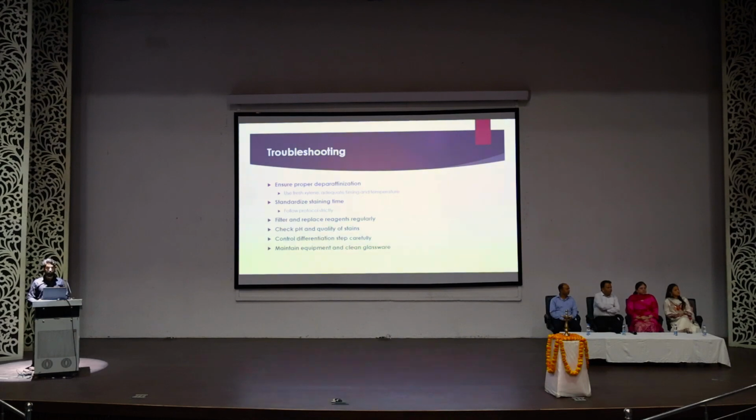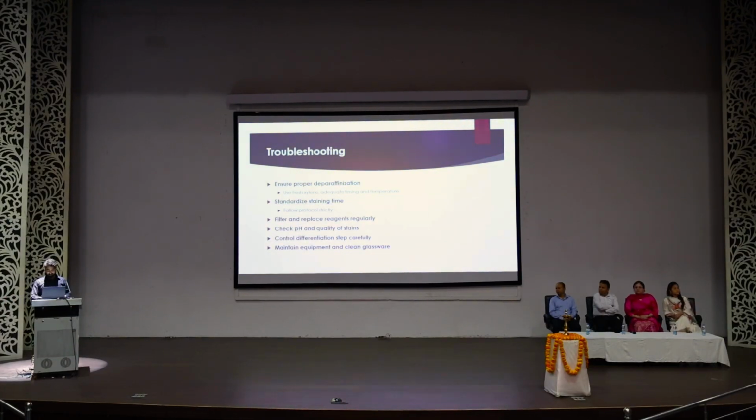As I have seen multiple times here in Jammu, many of the technicians use their hand like this, this much this way and this much that way. But this is not a scientific way. We must avoid it to ensure proper staining.